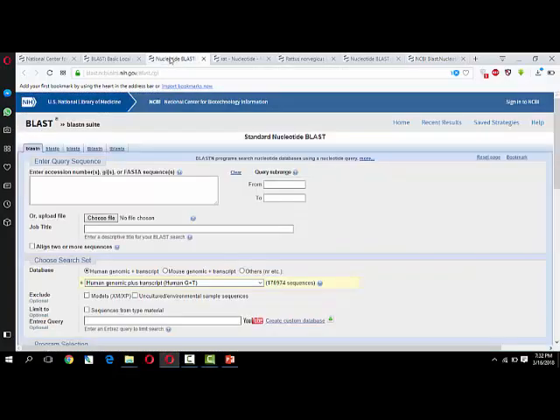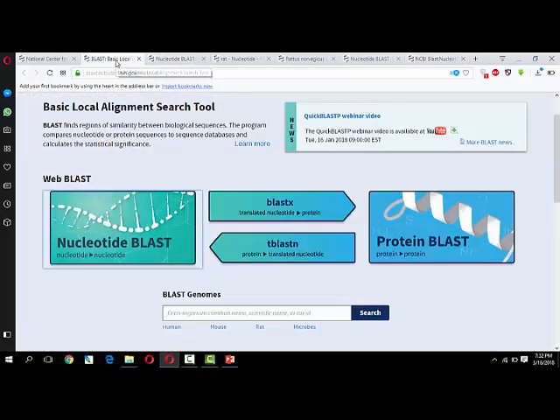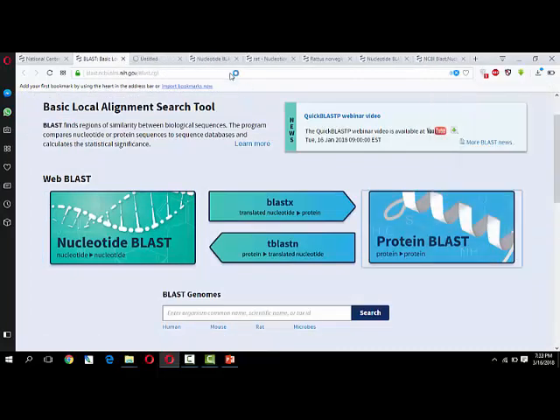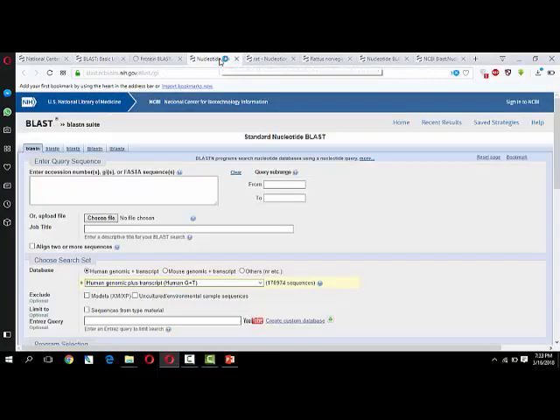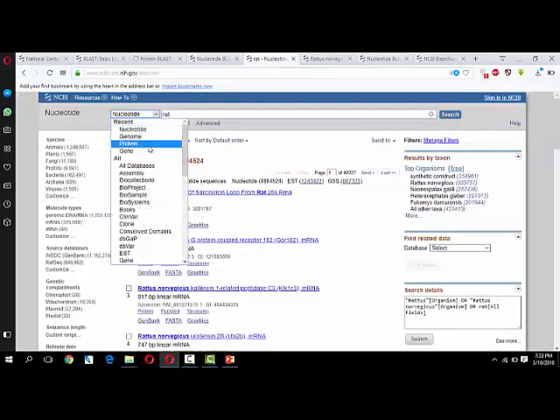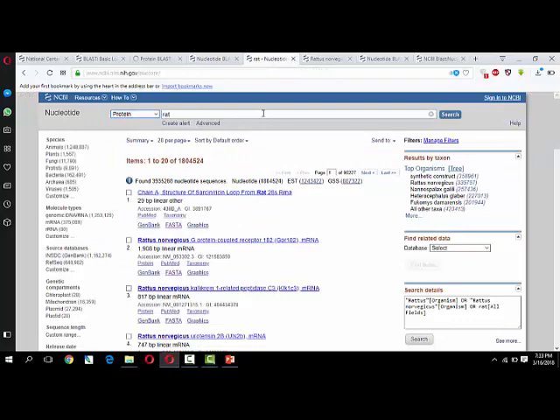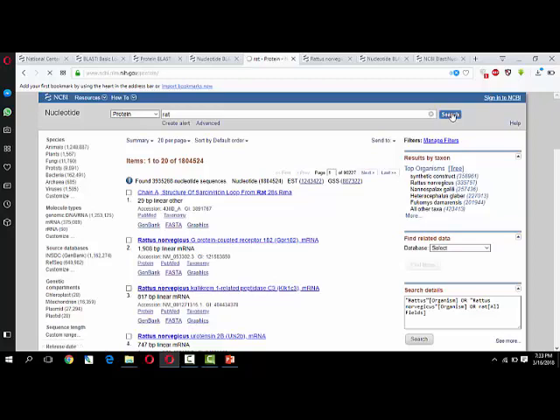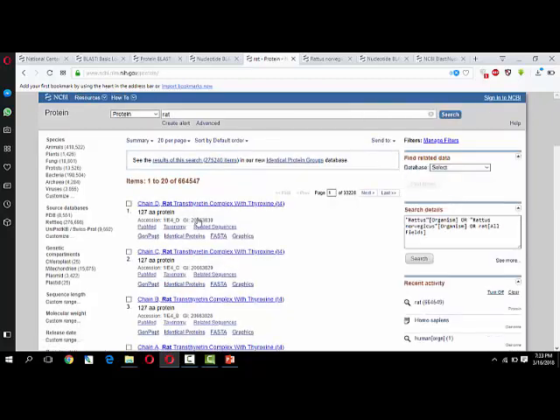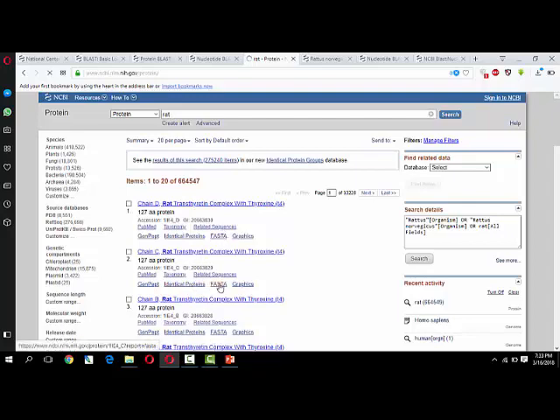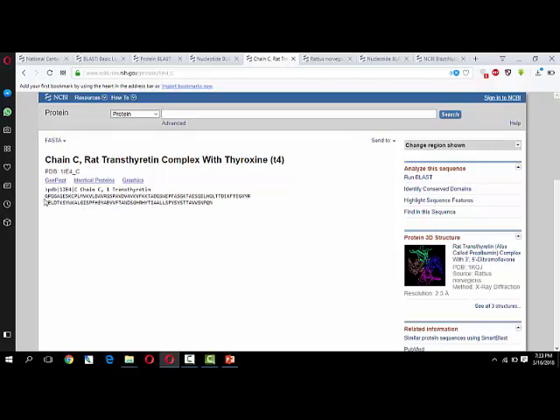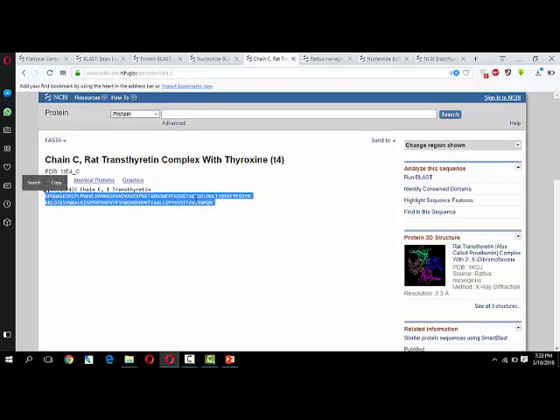Now if you want to do protein BLAST, simply click on protein BLAST. Select protein from here and click on search. You will get protein sequences of the rat. Simply click on this one, FASTA format. You will have this sequence of amino acids here.